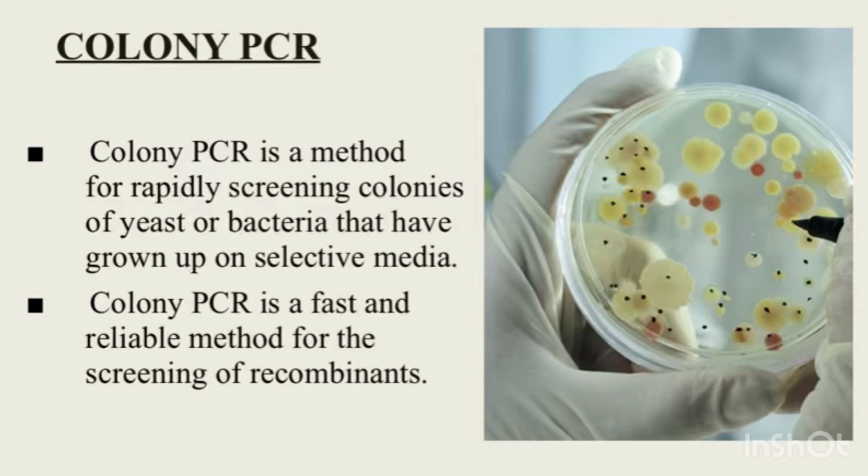Coming to the next type of PCR, which is colony PCR. Colony PCR is a method for rapidly screening colonies of yeast and bacteria that have grown on a selective medium. Colony PCR is a very fast and reliable method for the screening of recombinants.